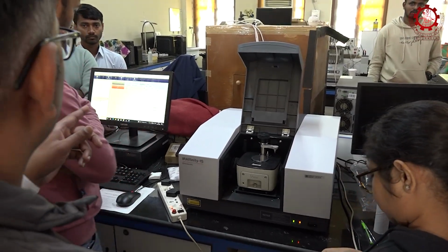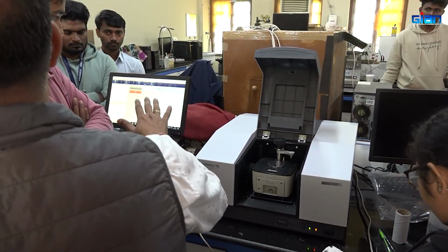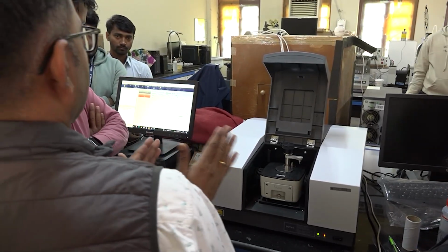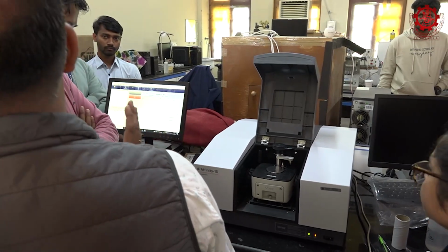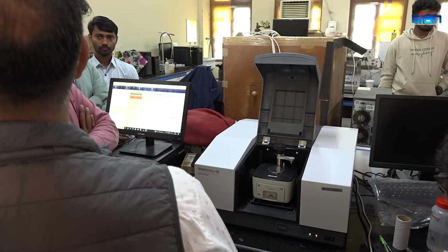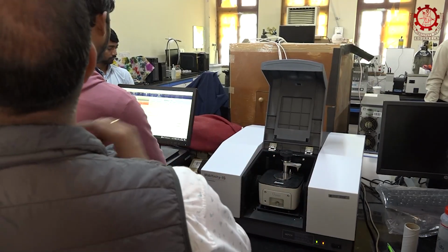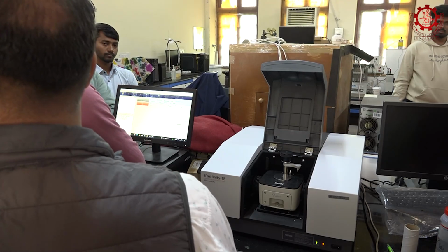Maybe step by step we can tell. So now the software which we will analyze, we open that software, and basically now you see what is happening here. In air, what do we have? Carbon dioxide, oxygen, nitrogen, and so on. So when we are making one sample, there is also air, right?